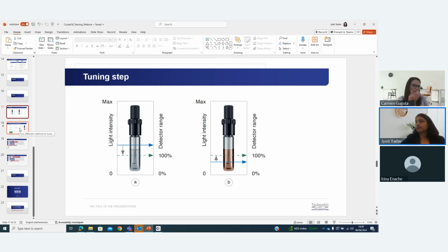And because the question was also related to the tune, a safe way if you really don't know anything about it, and of course you can also use predicted data. But mainly what the tuning does is calibrate your instrument for the solvent, and each solvent has a different viscosity and slightly different coloring, which will influence the quality of your experiment.